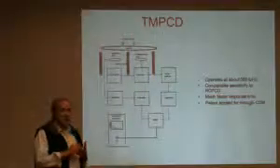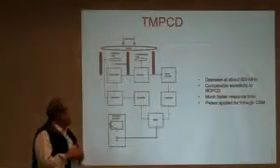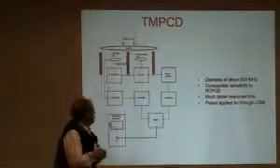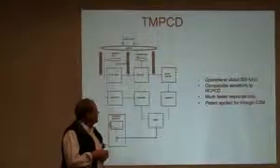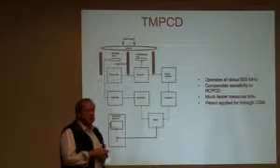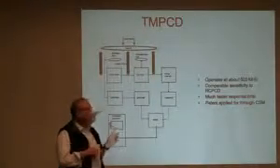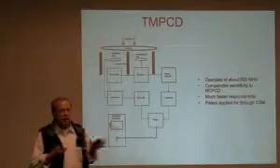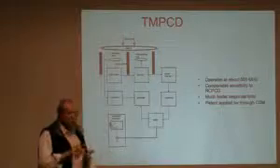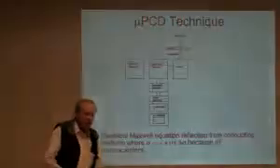Now this has several promising advantages. By the way, it operates at 500 megahertz. It has comparable sensitivity to the RCPCD from what we can see so far, but it has a much faster response time, so we can see shorter lifetimes. And we've applied for a patent on this. We have used this technique to look at some nanocrystalline silicon and any number of samples, which we'll show in a bit.